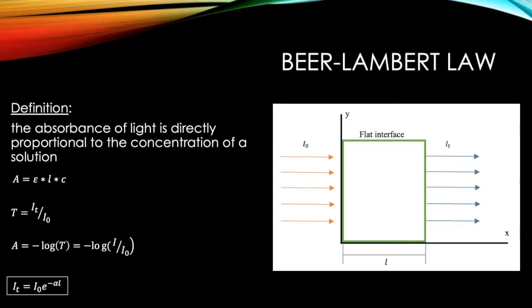This experiment will use these principles to demonstrate the Beer-Lambert Law by comparing different known concentrations of tea to the light that passes into a spectrometer built via 3D printing. Certain wavelengths will be examined to look at how the tea absorbs certain types of light at those wavelengths.